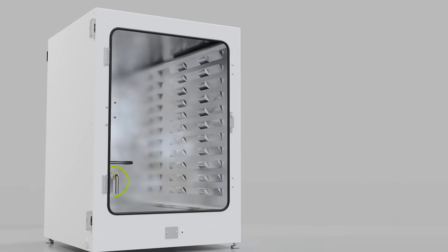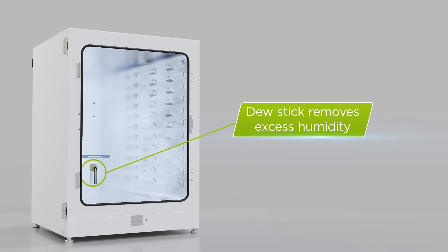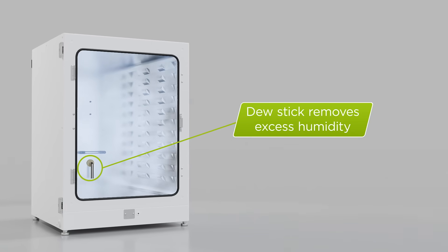Additionally, Incusafe includes a dew stick in the rear of the chamber that collects excess humidity that may otherwise condense near culture plates.